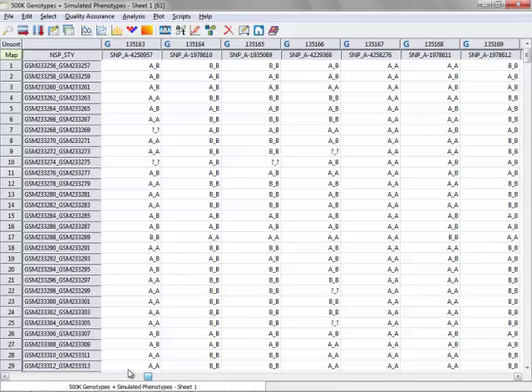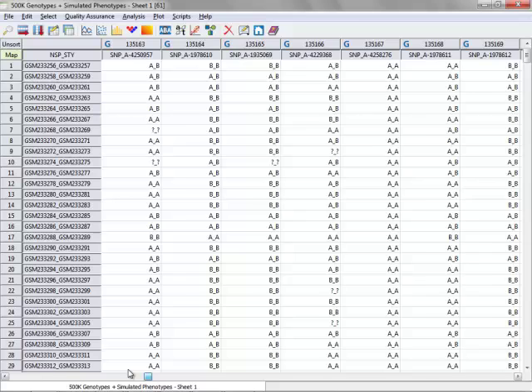Now that I've got the two spreadsheets joined, I'm going to go ahead and select my dependent variable for an association test. For this demonstration, I'm going to use phenotype 1 as my case control status. To make that my dependent variable, just left-click it once. That turns up magenta. Magenta columns designate that that column is going to be used as the dependent variable for an association test.